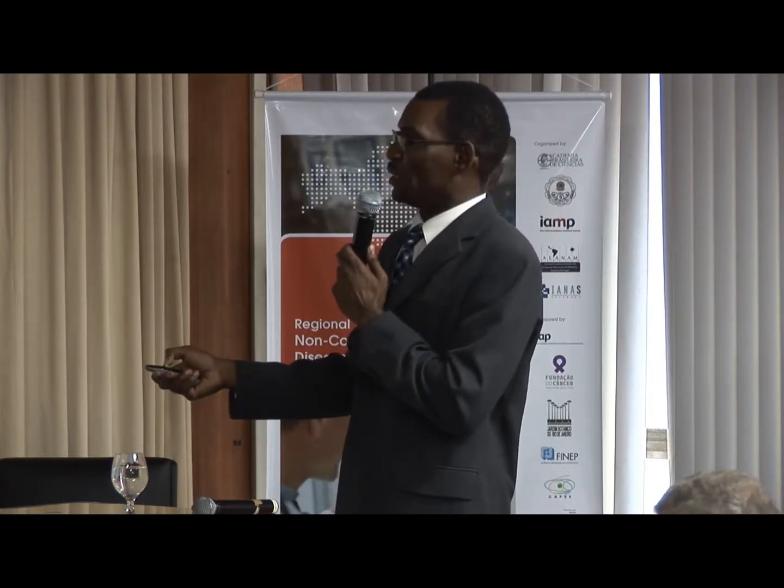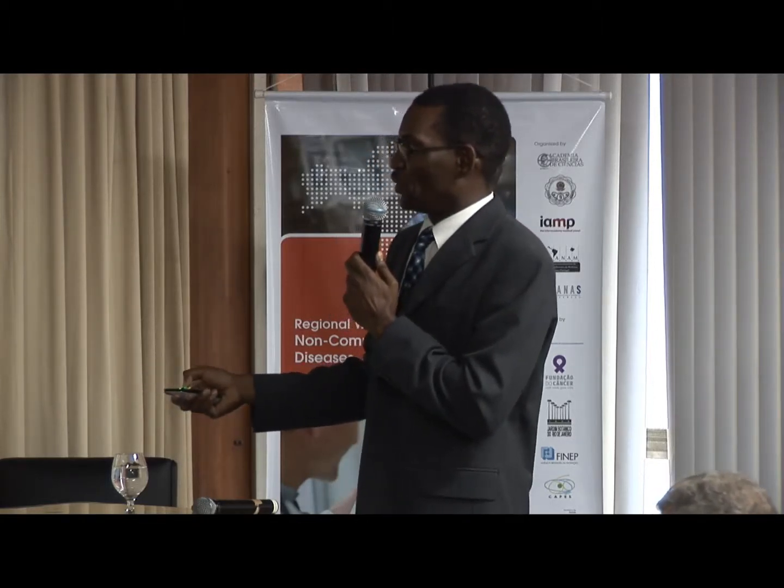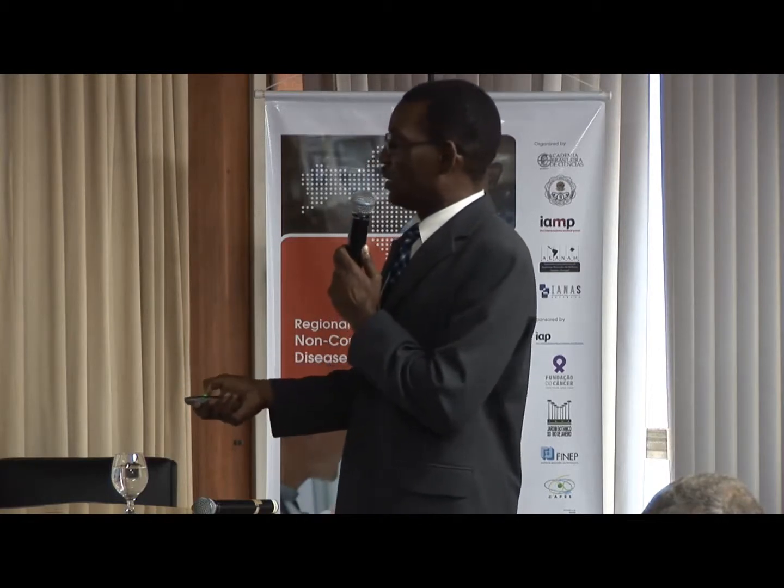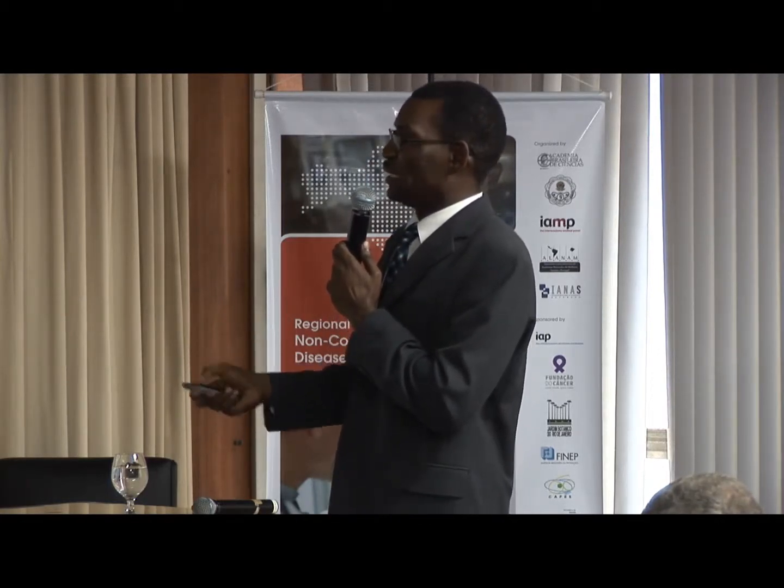If you compare the intensity of the color in the control, you see that for sample 3, even at a high dose, 200 micrograms per ml, the cells are still very much alive. So we will conclude that for this sample, the plant extract does not have a high effect to kill the cells, and therefore it would not be something that we want to carry further to do fractionation to see where the activity might be.